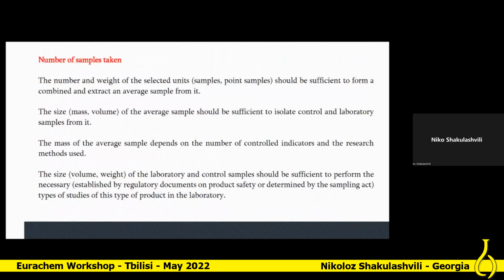And also the number of samples to be taken. How many samples shall we take, or what should be the weight of these units, of these samples? This depends on the type of test, analysis, and particular object. In any case, this size should be sufficient for our tests.